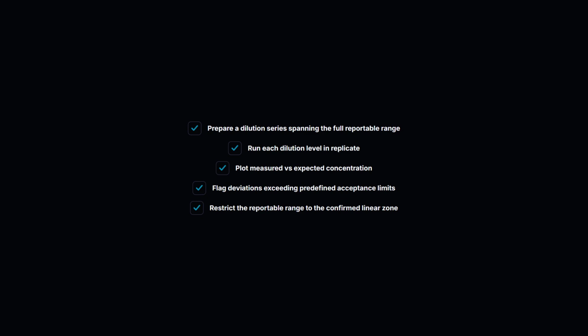Beer's law isn't wrong. It's a first-order approximation that holds beautifully within a defined range. Knowing exactly where that range ends is the difference between a trustworthy result and a quietly wrong one. So how does the instrument actually generate that absorbance reading?